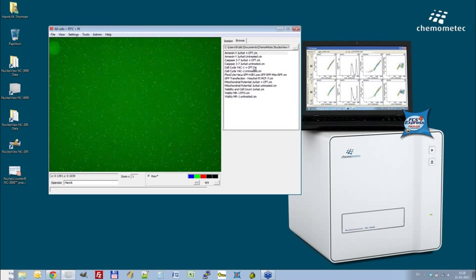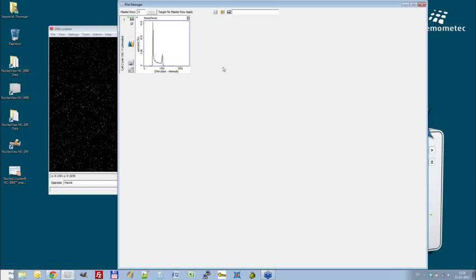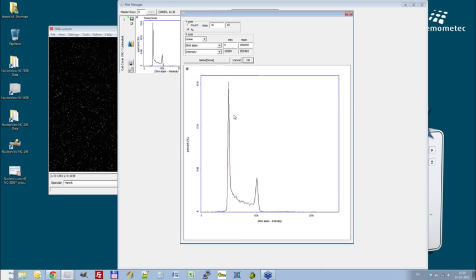If we look into our cell cycle of untreated cells, we have here the easy results. Very nice cell cycle peak. We have a comparison of our cell cycle assay with a BD LSR II, and we have shown that there is absolutely no difference between an LSR II and the Image Cytometry NC-3000 NucleoCounter in regards of coefficients of variance on the G1 peak, which is normally the way you measure how precise a cell cycle is done.